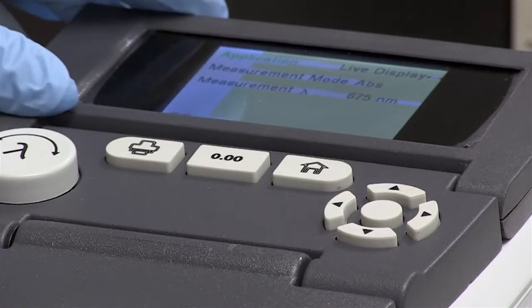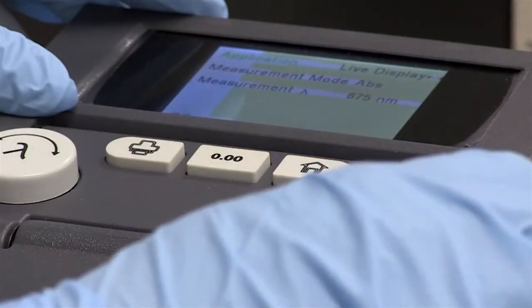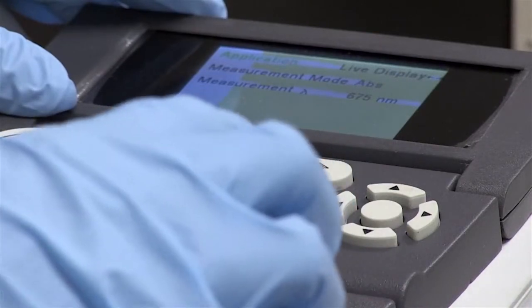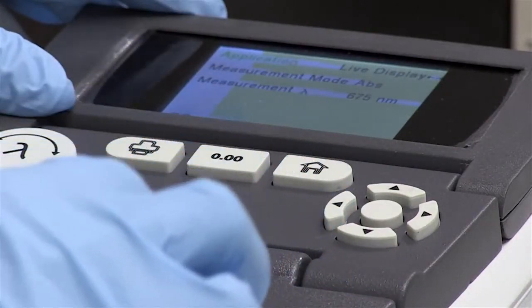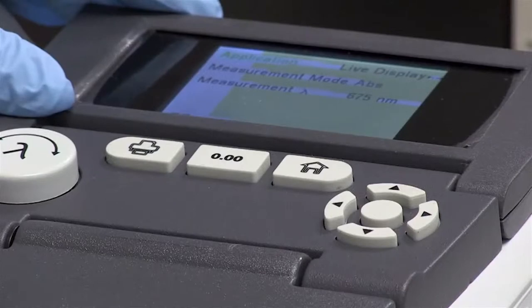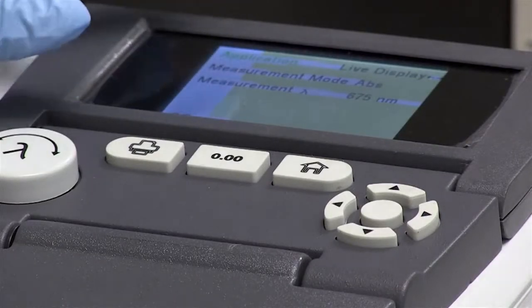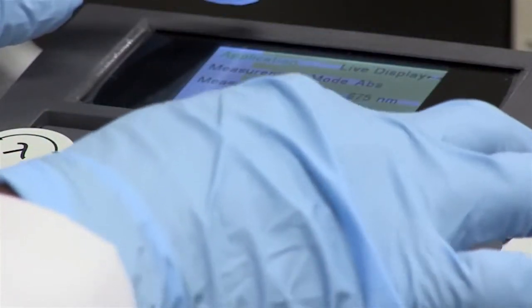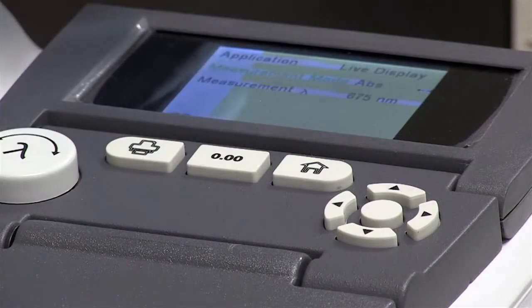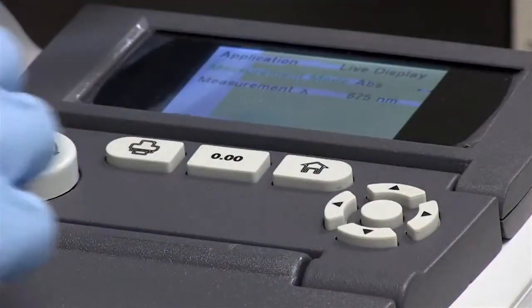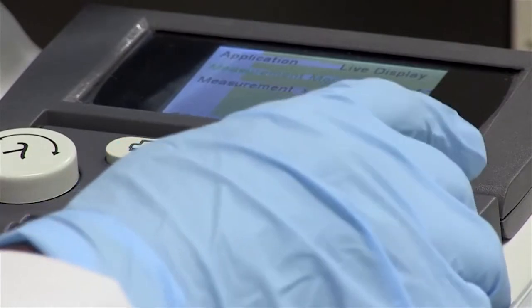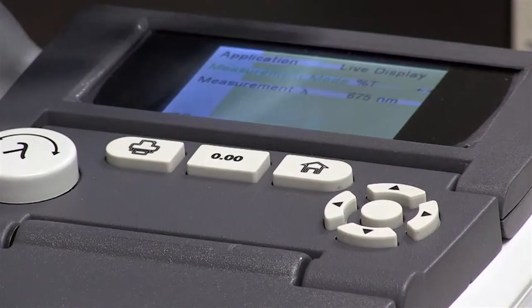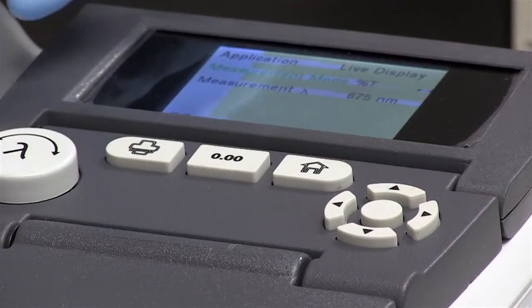We can either measure in absorbance or in percentage transmittance. In your lab write-up there is a calculation to calculate the percentage transmittance and the absorbance, but you won't have to use a calculator in this case — you will actually get a direct reading of your absorbance. If you want to change the measurement from absorbance to transmittance, all you need to do is press the right arrow and the sign '%T' comes up, so whatever you measure will be the percentage transmittance.